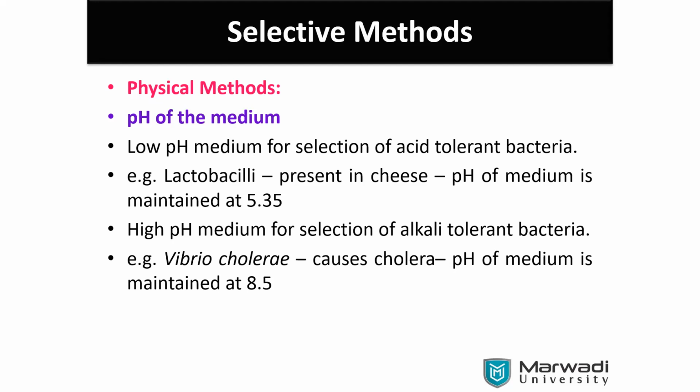Okay. So when HCl is added, H and Cl are highly reactive species, and they may start to react with one another. They may start to precipitate things. So while preparing the media, you will find that something is already precipitated. So we have to go for synthetic media preparation. We need to add the different ingredients one by one. We cannot go directly to the nutrient broths.